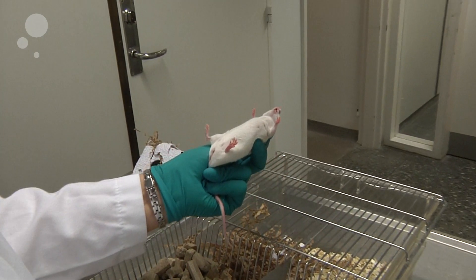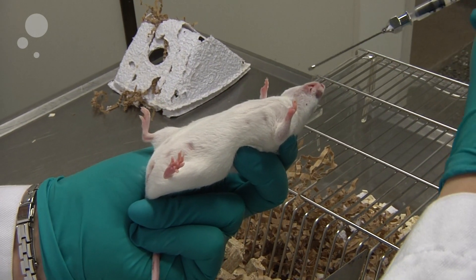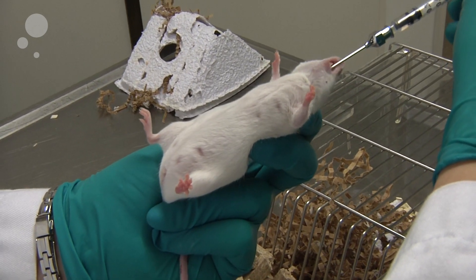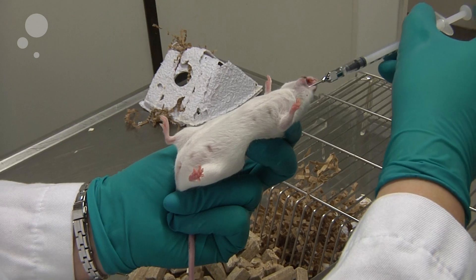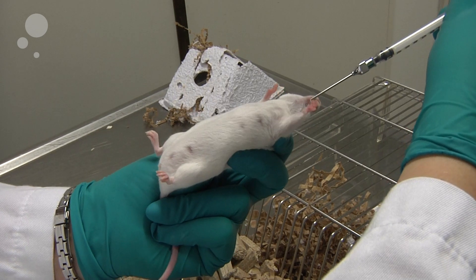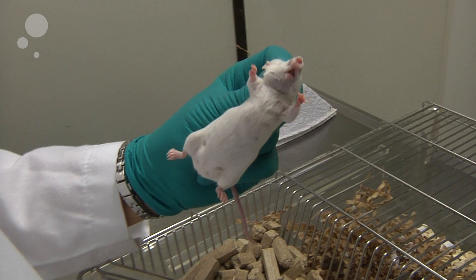Make sure that your gavage has the right length from the mouth into the stomach, then introduce it into the mouth of the mouse. Gently place it over the tongue and introduce it into the esophagus, entering the stomach. Dose your fluid. Make sure not to place the fluid in the lungs as it will kill the mouse.